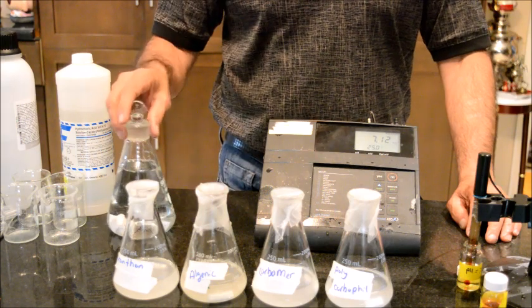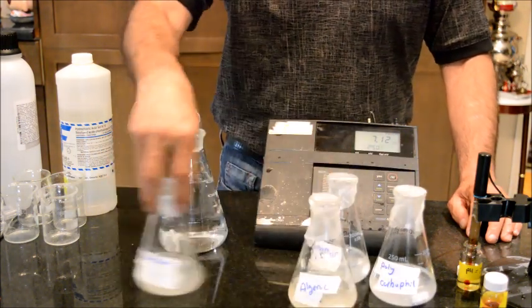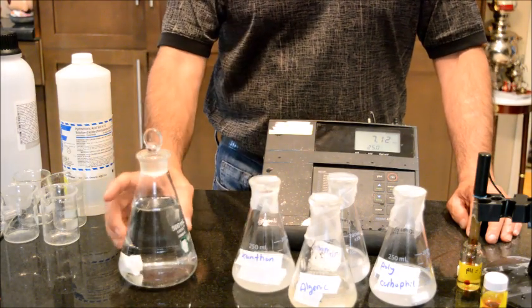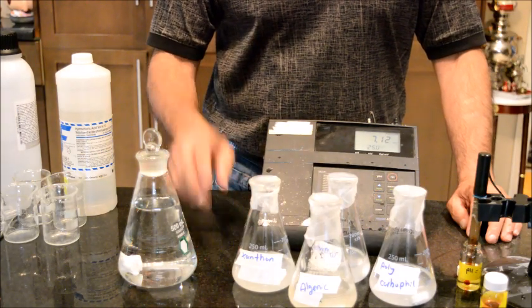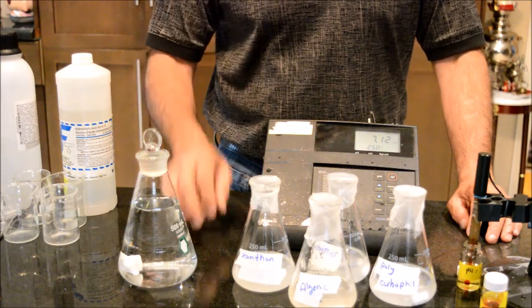Now the solution that I have here beside me, this is a simulated vaginal fluid. So I'm going to test these gelling agents in the simulated vaginal fluid, see how it is behaving.